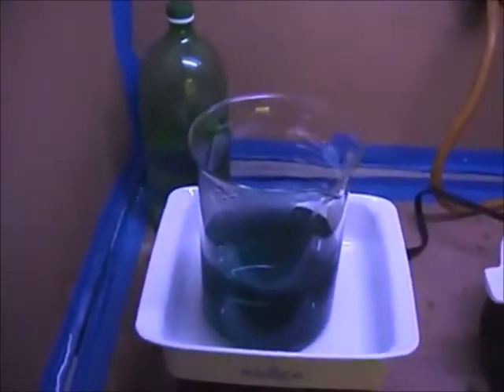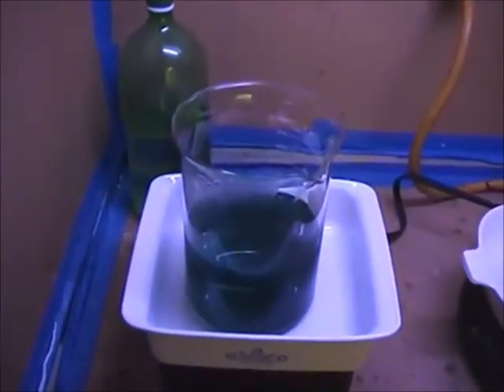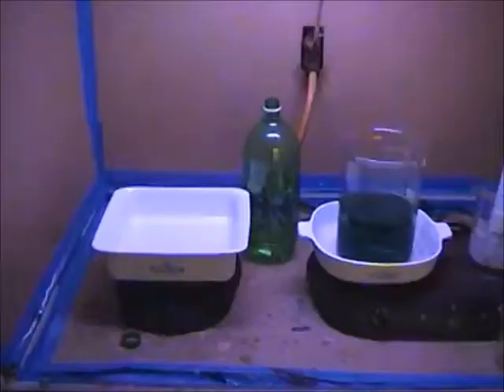So we're going to cut away and let it snow here for a minute, and I'm going to switch back over to the other beaker, and I'm going to show you how we precipitate that out. So give me just a few minutes, gentlemen, and I'll be back with you.